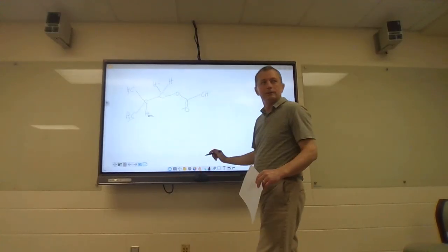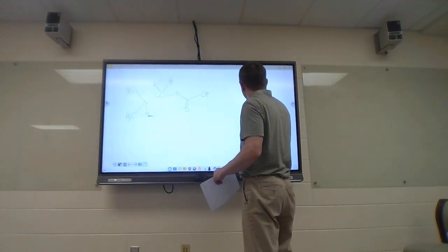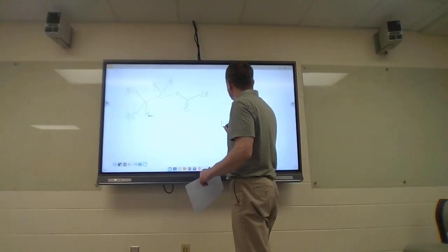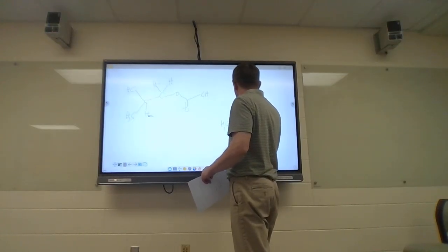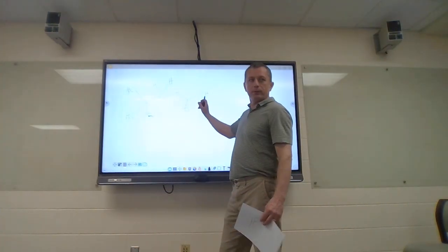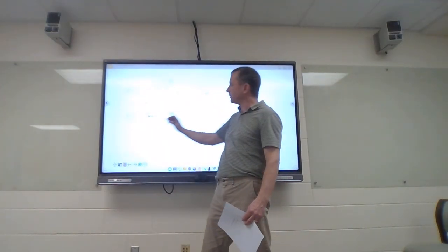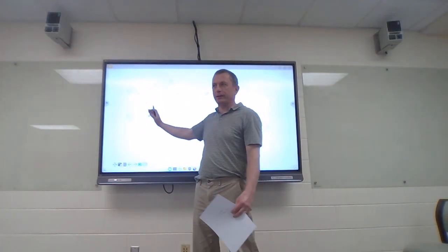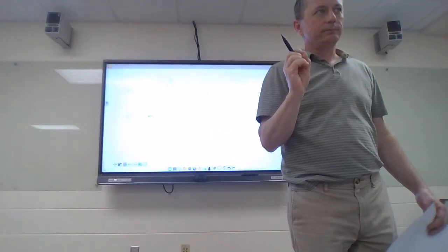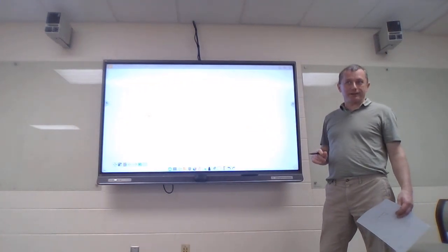I have one more question about 7. Yeah. So, like the 2 H3s on the left are for that first peak at 1, but then the second and third peak, which hydrogen's on? This is overlapping with that one over here. So you're seeing a sharp singlet for this one, and a bunch of peaks kind of right in the same area that are much smaller. Yeah, tricky. This one does the same thing but separates it out.